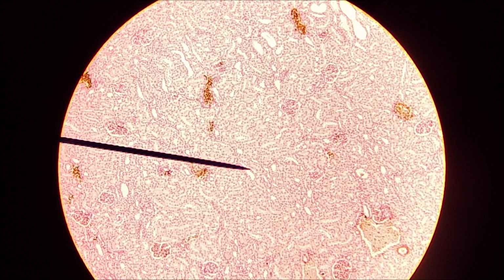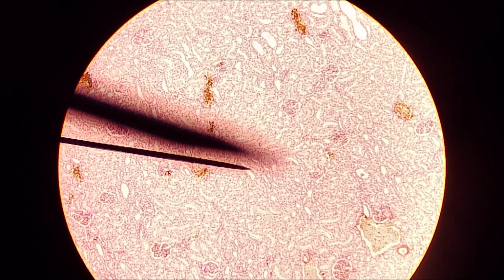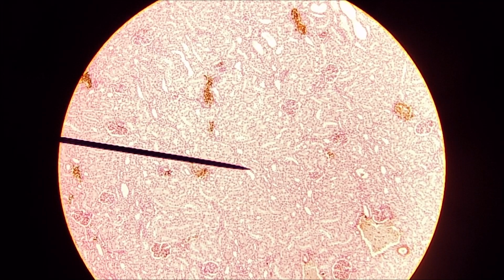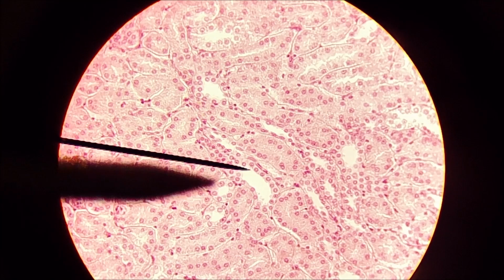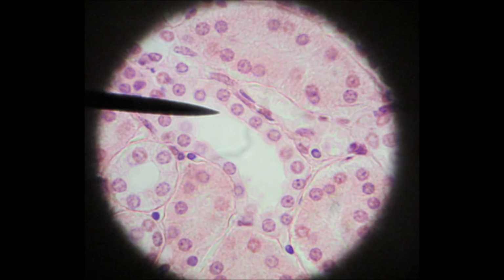So here's a layer. You can see there are like little round structures, like smaller holes, basically, all over the place. There's a big hole right where that pointer is. Those big holes, that's part of a collecting duct. And I can go in a little further, and there are the cuboidal epithelium, simple cuboidal. One layer thick, and the cells are indeed quite square.